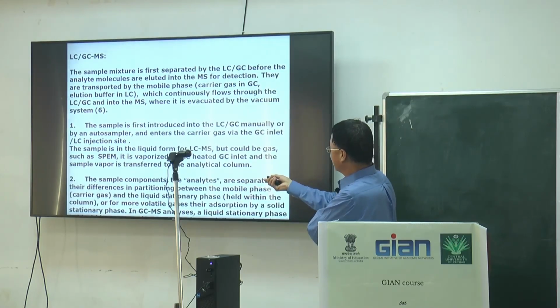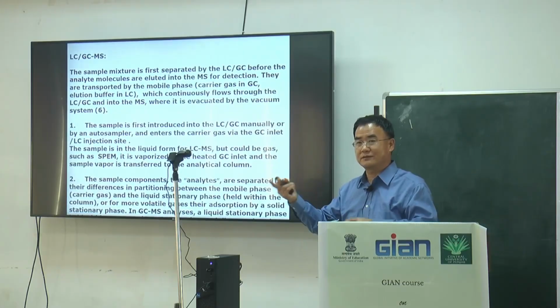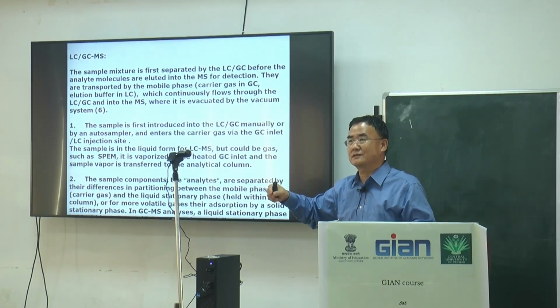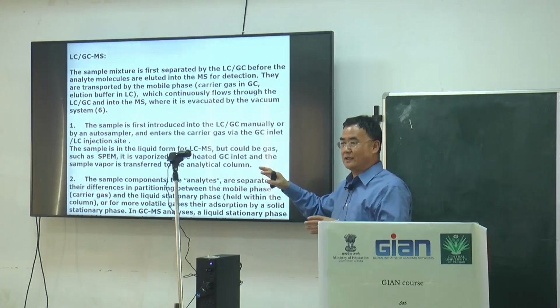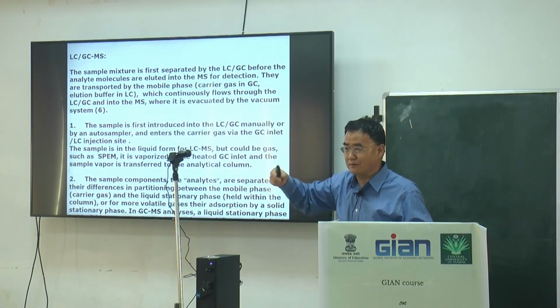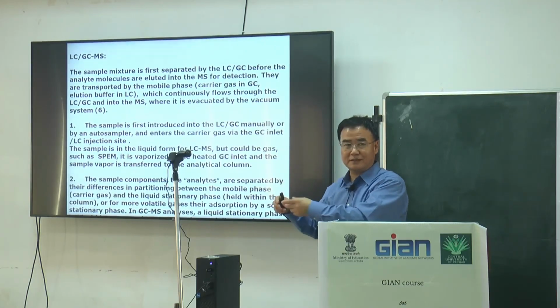For GCMS, most samples are liquid. We extract the liquid, dissolved in solvent. For enzyme reactions, we use hexane to extract the substrate and products, then analyze. Also for monoterpene reactions, we isolate the gene, express the enzyme in bacteria, then purify and do the reaction.